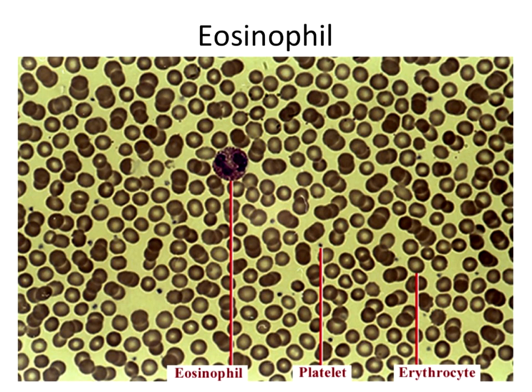Red blood cells are really easy to identify. They're always going to be those cells that just look kind of flat and donut-shaped. Notice that none of your red blood cells have any nuclei. They don't have a nucleus in them, and in lecture we'll talk about exactly why that is. They lose their nucleus as part of their development.